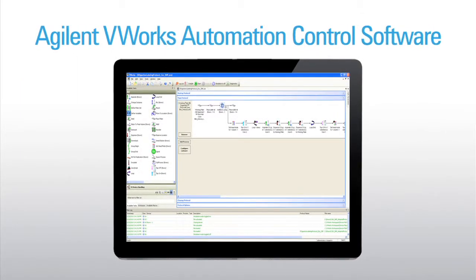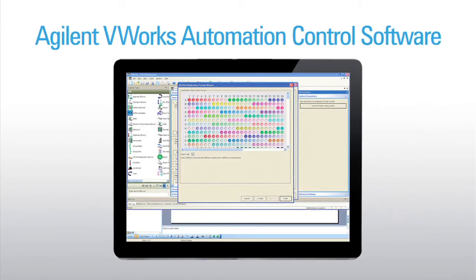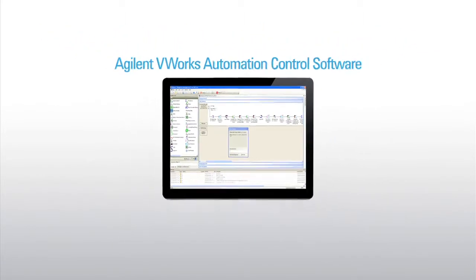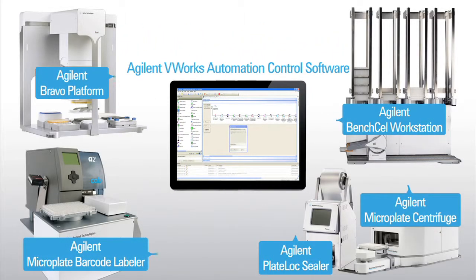The BenchCell can be controlled by Agilent V-Work software or compatible third-party software through its ActiveX control. V-Work's event-driven scheduler can control most Agilent lab automation products and many third-party devices to provide the utmost in walk-away time.